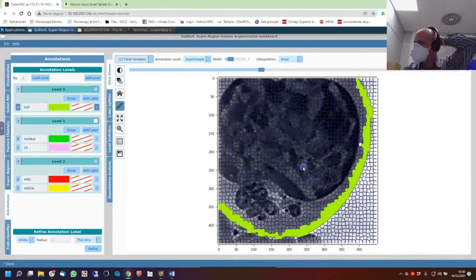The shadows gradient, you know what I mean? I don't know what I mean, Luca. I think that this is most of the part of visualization. We are just painting. I don't know if you are going for 3D. This is not for 3D. This is just for creating the masks.